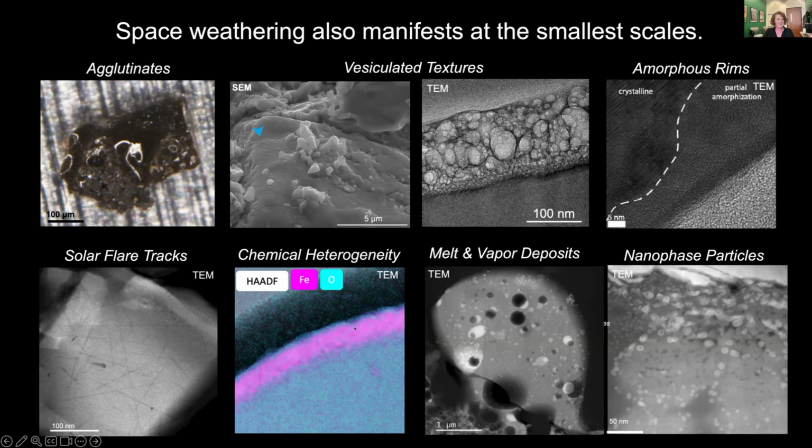Then we have impact events that are changing the chemical composition of the outer rims of the grains. They are melting and vaporizing material, and some materials lost from the system when you have one of those impact events, shown in this EDS map of this chemical rim on the surface of this grain returned from the moon.